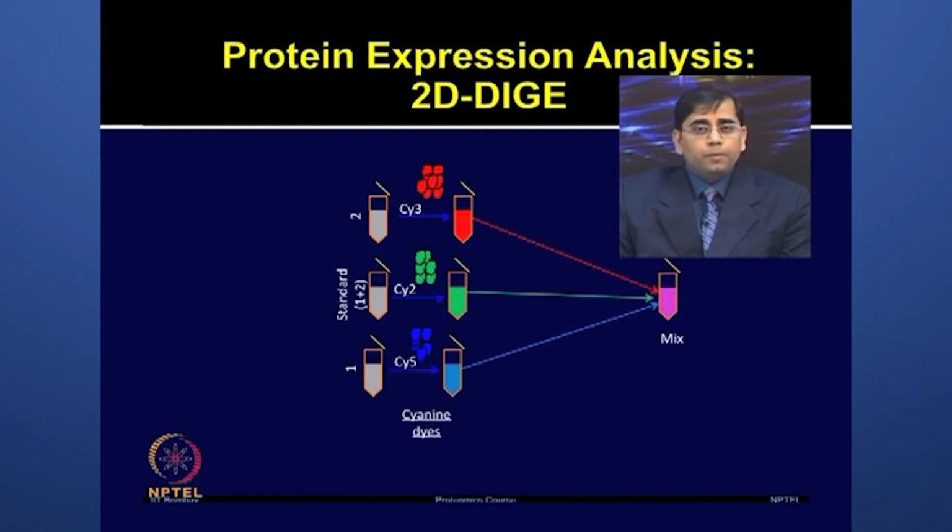Depleted serum samples obtained from patients with Gleason score 5 and Gleason score 7 were used for comparison and further analysis.